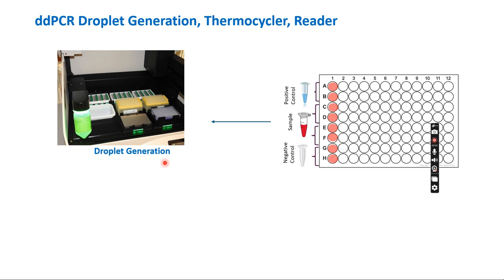Here is one note. If for any reason you have wells which you are not using, say you are using all of 2A to G and you are not using H, you must fill up the H with buffer or any water would be fine, but I would recommend buffer. The idea is that you cannot make a blank.